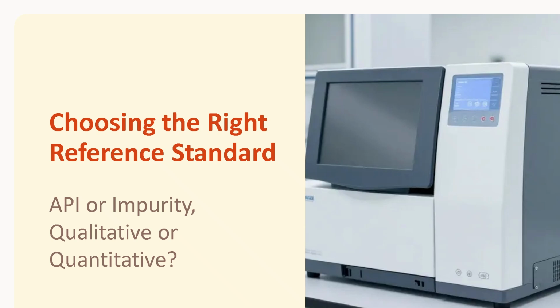Let me start by asking you a simple but very important question. Have you ever completed an HPLC analysis, saw all peaks clearly, system suitability passed, but then paused and wondered, did I use the correct reference standard? Should I use the API standard? Or the impurity standard? And am I identifying or quantifying? This decision may look small, but in pharmaceutical analysis, it can directly impact data accuracy, regulatory compliance, and ultimately, patient safety. Today, let's understand how to choose the right reference standard, scientifically and confidently.